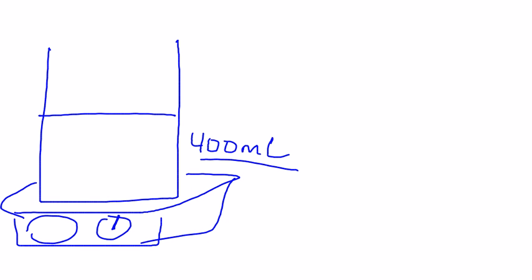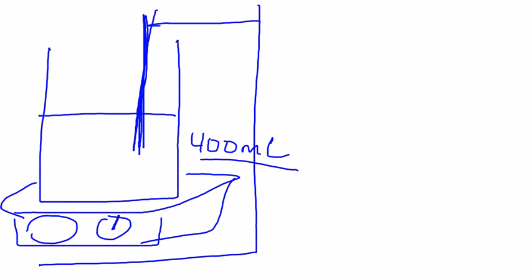Here's your stir plate. You want to select a number, not 50. There will be loss of energy, so you must put a thermometer inside to maintain the temperature. So make sure you clamp that thermometer. It should take the temperature of the water, not of the walls or the bottom of the container. And then you can put your flask. Usually this flask would not sit all the way in, but would be a little bit tilted on the side.